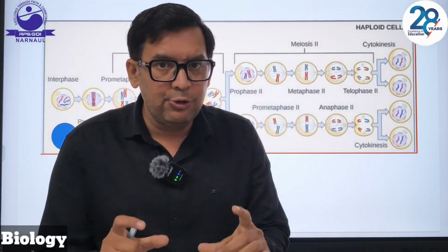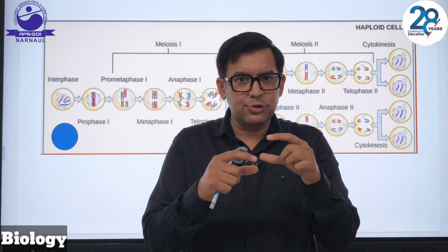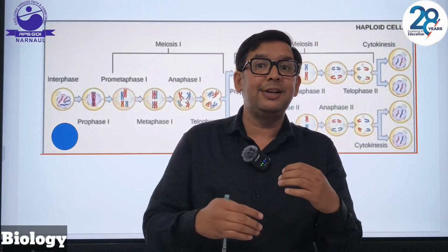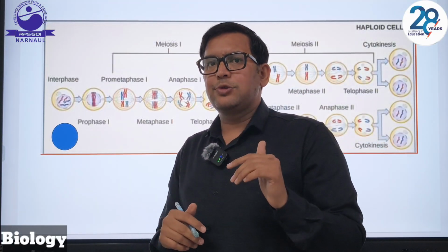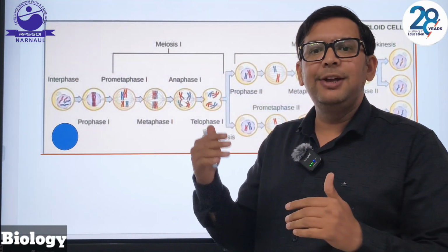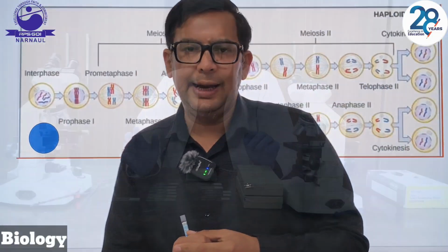Now we will take our slides one by one under the microscope and try to shoot them with the help of a camera so that you can get a real picture. When we observe under the microscope, step by step I am going to explain the main observations or the main steps. Let's move to the lab.